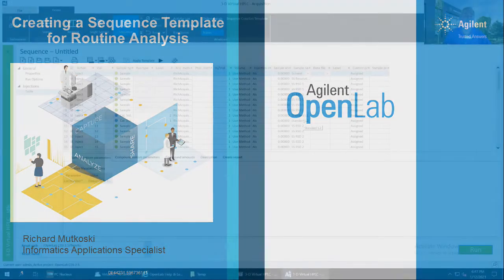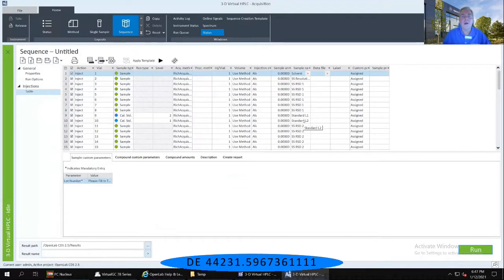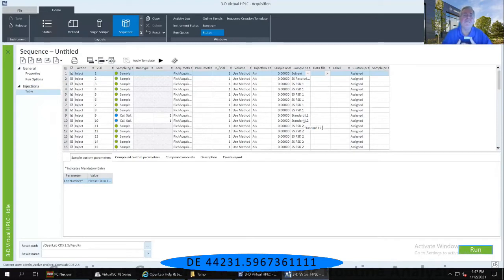Let's say I come from a QA/QC background and I have to, for the next six months, every day create the exact same sequence to run my stability studies. I could always pull up a previous sequence, but then I have to go through and individually name different samples, maybe change the locations of where these things are. It can be very cumbersome to do that from a previous sequence.